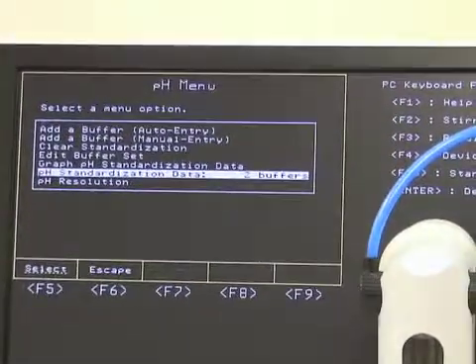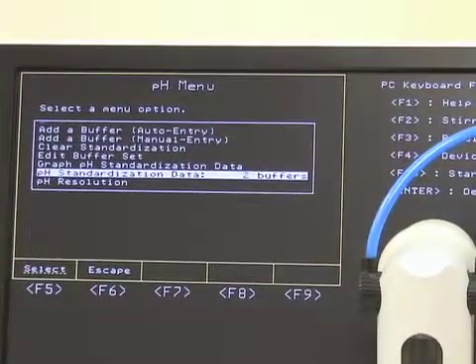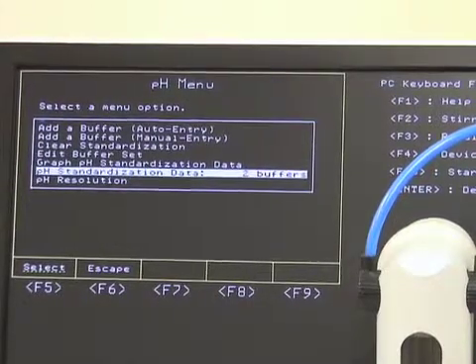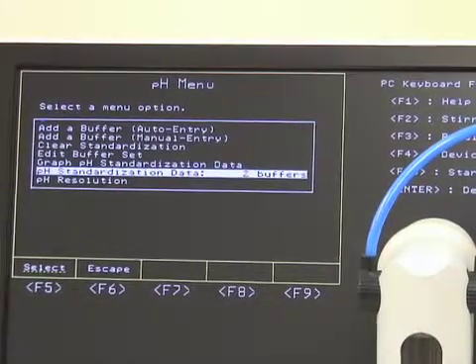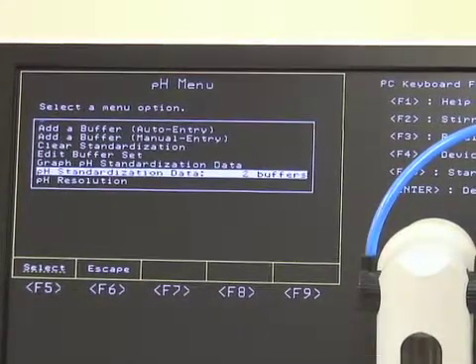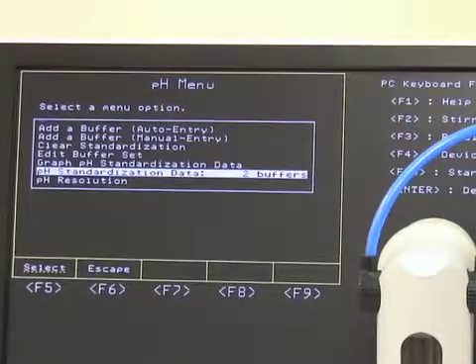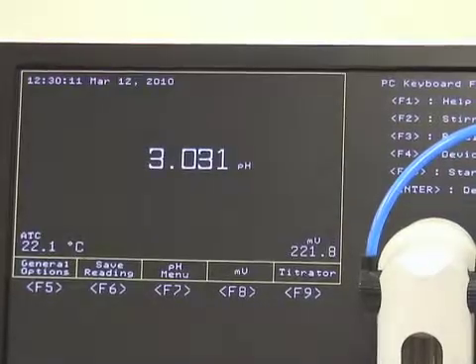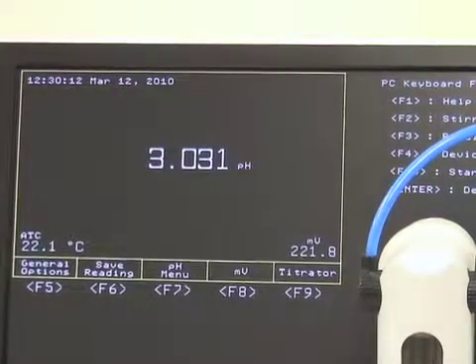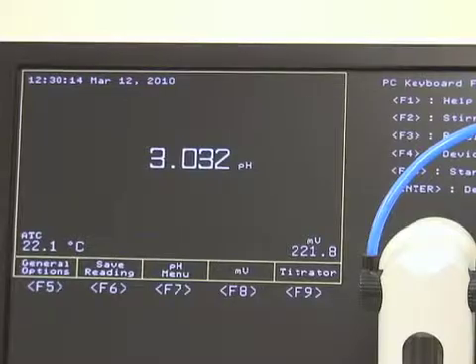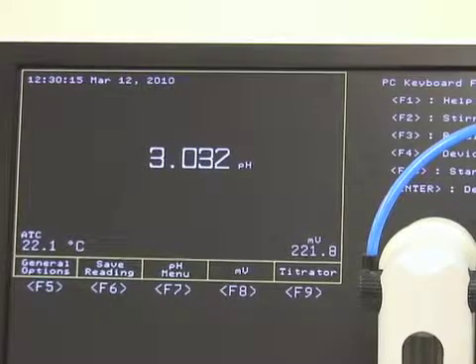So that is it for calibrating the pH probe on the HANA 901 and 902 auto titrator. We're going to escape out now. Thank you very much — we're going to move on to our next test.